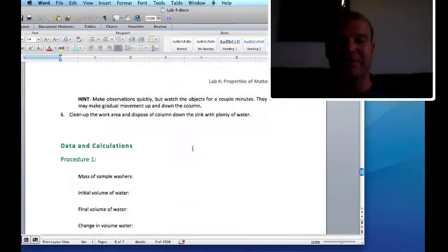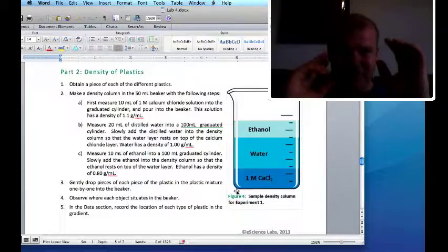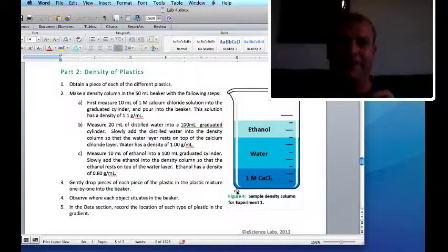So do it kind of quickly. It says to look at it a little bit. But at the same time, this stuff will mix. And don't take your stirring rod and mix it, because then you're going to make a mixture, a uniform mixture. So remember, the key to this lab is to pour the liquid slowly, but to do the measurements quickly. But do it as best as you can.